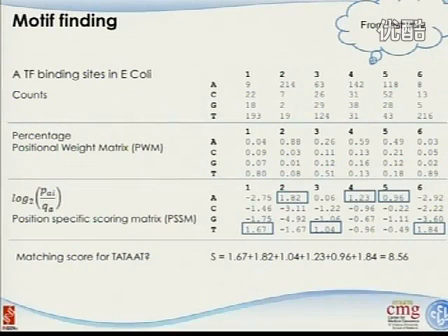And after the ChIP-seq data analysis, all the previous effort is trying to see where the binding site occurred, okay? Just based on the signal processing, just looking for the experimental signals. But after you identify the regions where the binding occurred, you want to understand a little bit more about the features of this protein binding. For example, you've got a transcription factor, let's say AP1. I want to know for AP1 what the binding site is, what the motif is.